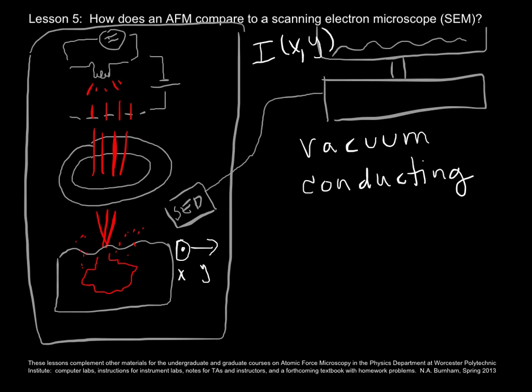So that's a disadvantage, but what you can do with these electron beam steering optics, those are very nice because it's very fast.